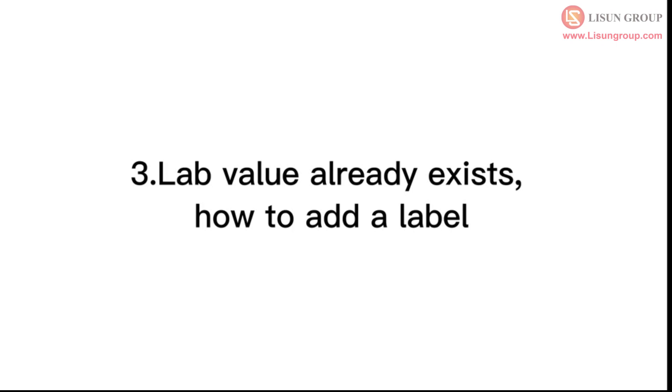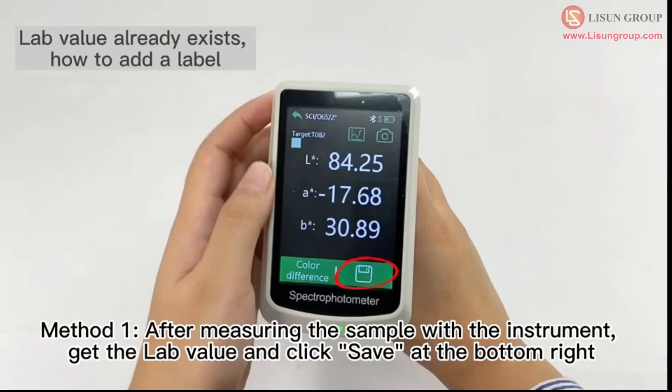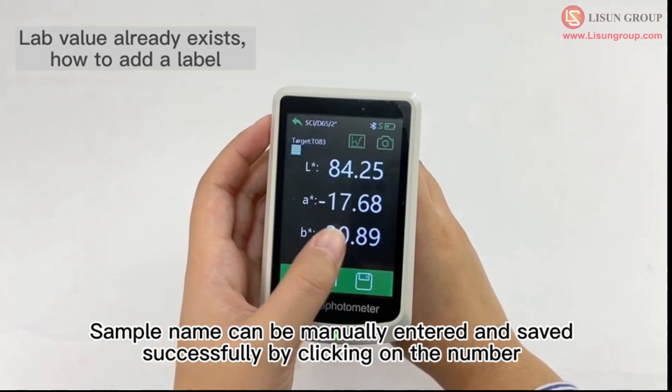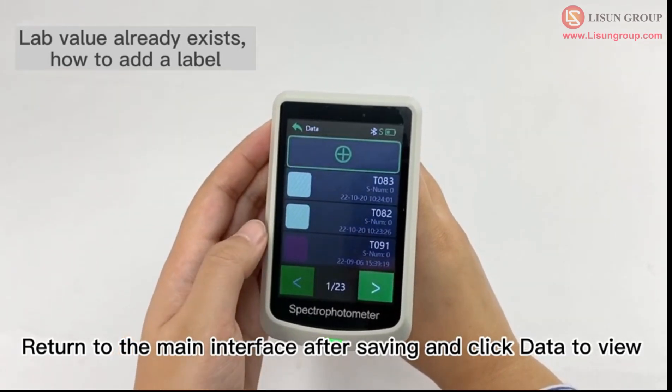If the LAB value already exists, here is how to add a label. Method 1: After measuring the sample with the instrument, get the LAB value and click save at the bottom right. The sample name can be manually entered and saved successfully by clicking on the number. Return to the main interface after saving and click data to view.